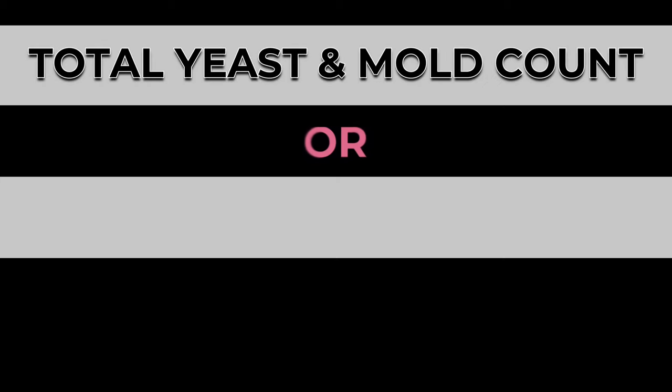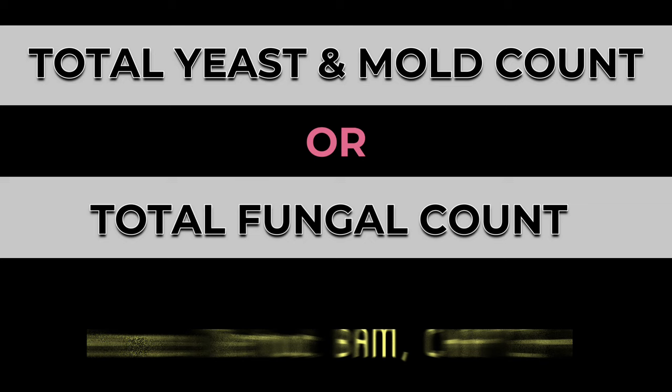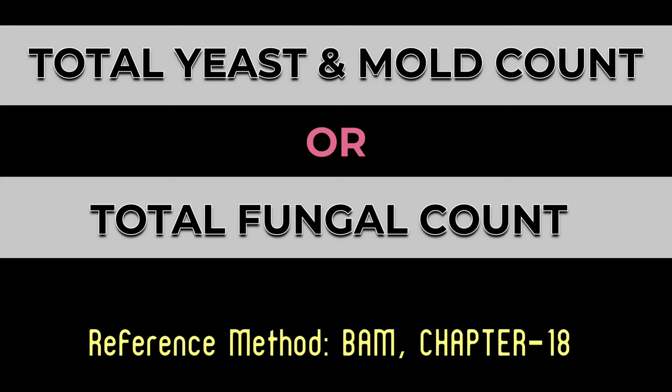Total yeast and mold count, or total fungal count, is a very common and important test parameter which represents the microbiological quality of any sample. Dear viewers, in this video, we are going to present an appropriate test method for total yeast and mold count.